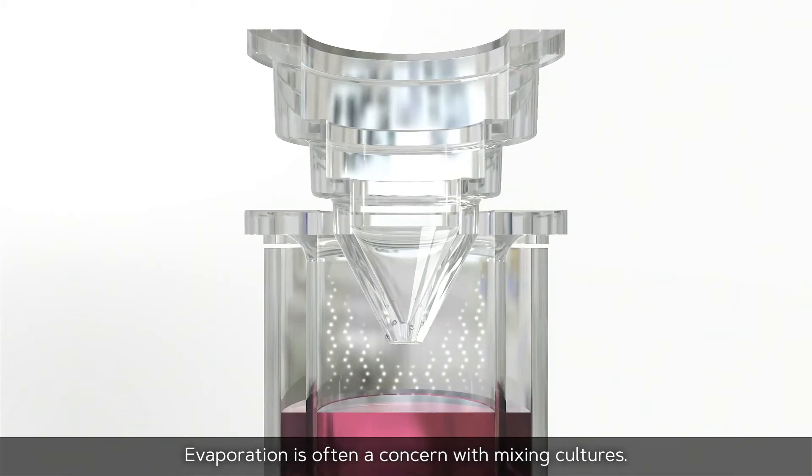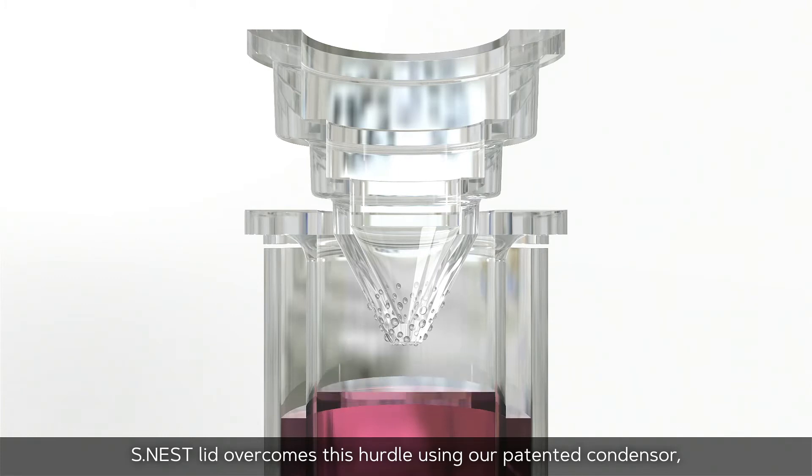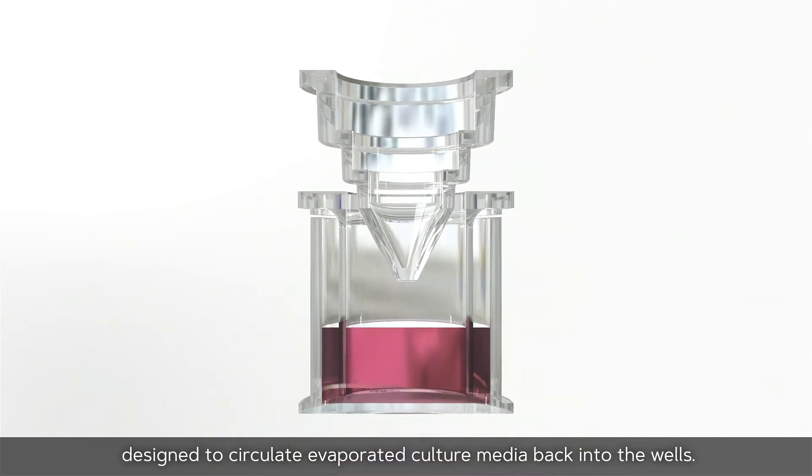Evaporation is often a concern with mixing cultures. The S-NEST lid overcomes this hurdle using our patented condenser, designed to circulate evaporated culture media back into the wells.